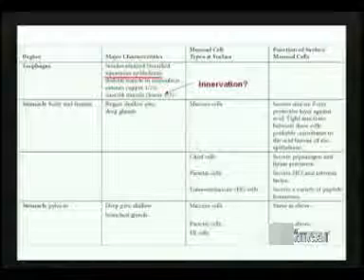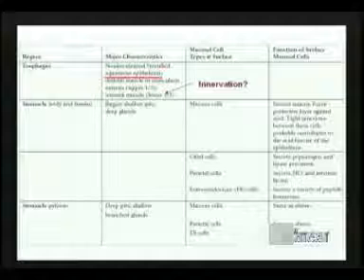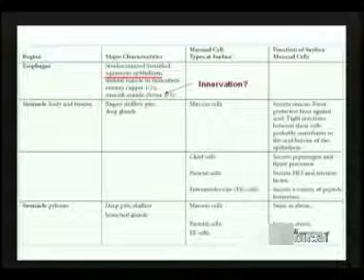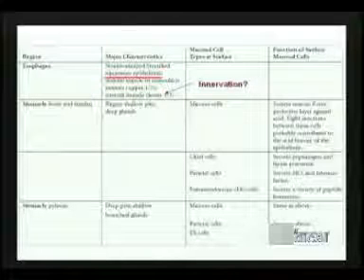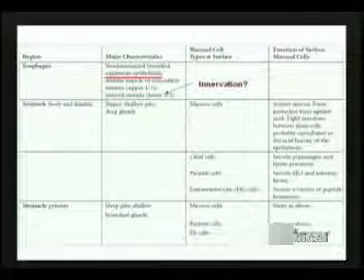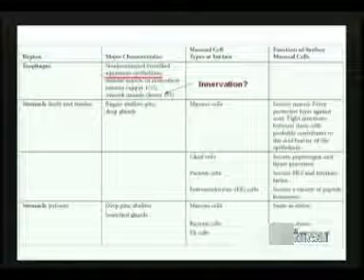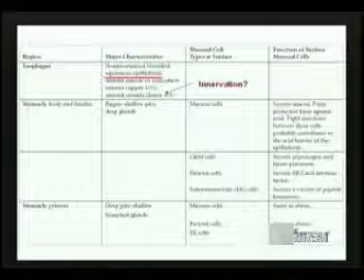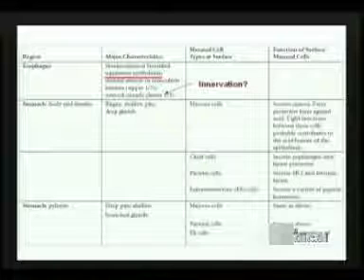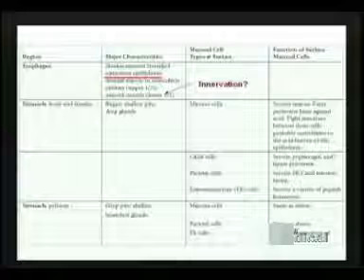Also found at various points in these deep gastric glands are chief cells that produce pepsinogen and lipase precursor. They tend to be found at the bottom of these glands. Parietal cells are found in a variety of locations, both near the luminal surface and more deeply placed. Their major job certainly is to produce hydrochloric acid, but their other major secretory product, which is essential for life, which enables the absorption of vitamin B12 from the terminal part of the ileum, is intrinsic factor. And then certainly there are going to be a variety of enteroendocrine cells that are populating these gastric pits.